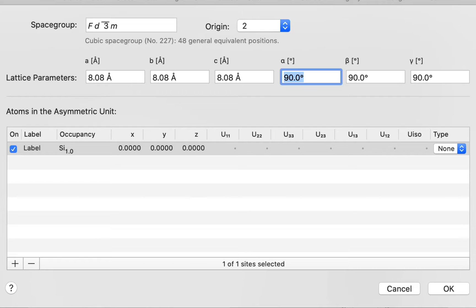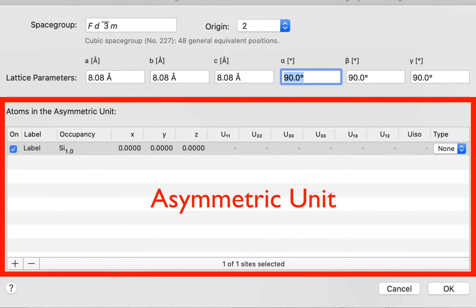Now we come to defining the asymmetric unit. This is the minimum group of atoms which, when combined with the lattice type and space group symmetry elements, is sufficient to generate the entire contents of one unit cell. It turns out that the structure we're building has 56 atoms in the unit cell, but we only need to specify three in the asymmetric unit because of all our symmetry.